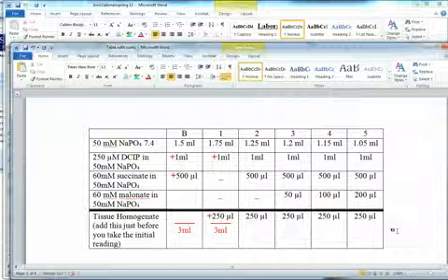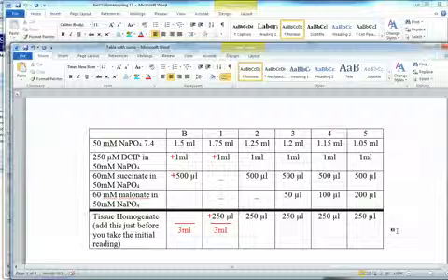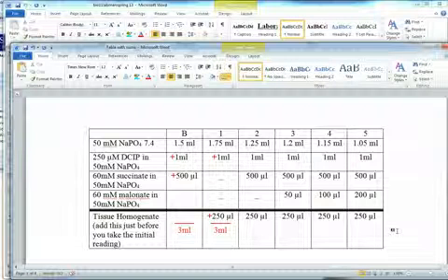If the interaction that we did is true, and of course it is true, then the exact same result would occur if the reaction total was 1 ml or 10 microliters or 35 liters. It wouldn't matter. When we write the lab manual, we want to show students in Bio 11 at Hofstra University how to do a reaction with the reagents and the tools that we have.